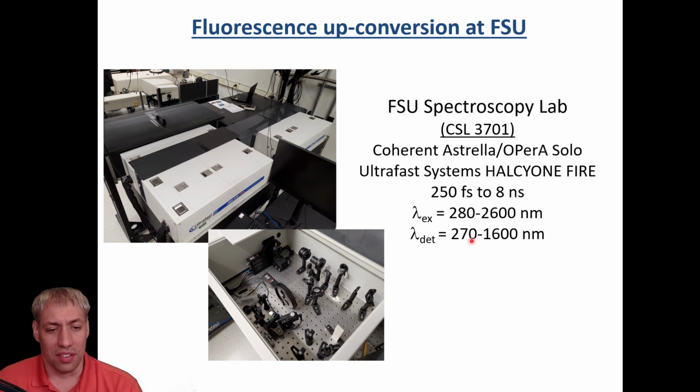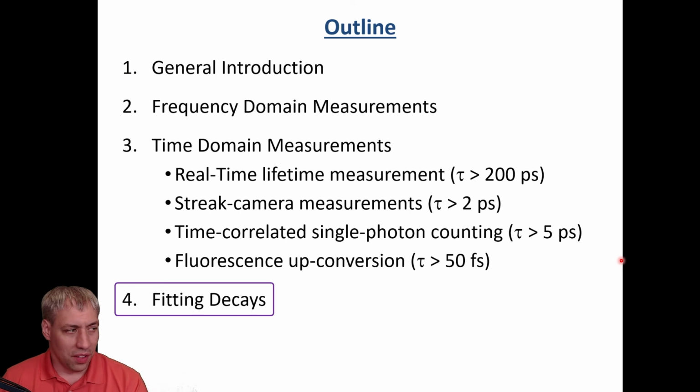And so you can see excitation and detection ranges. It really depends on what sample you're looking at, but again, ultrafast emission decays, we can measure on this system, and then there's our nanosecond TA setup. If anyone's interested, we have a user submission process, or users can actually visit the facility to use this instrument. We spent all this time trying to get emission decay traces, so watching emission decay over time, at least with the time domain measurements.